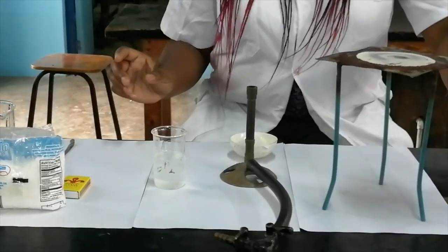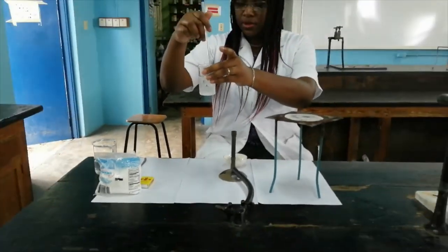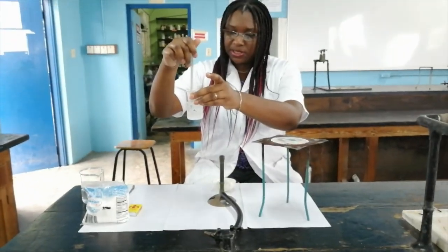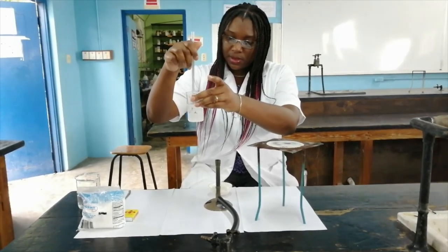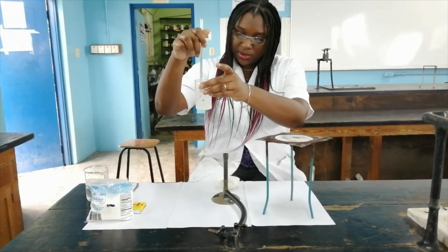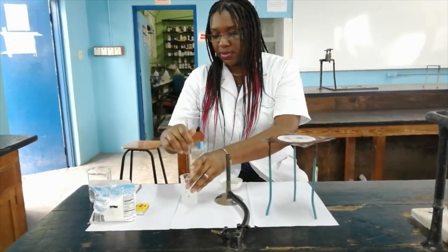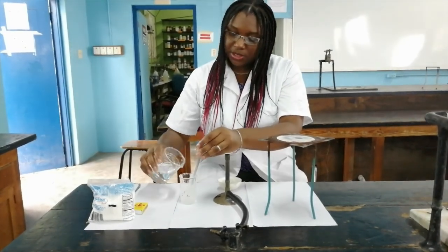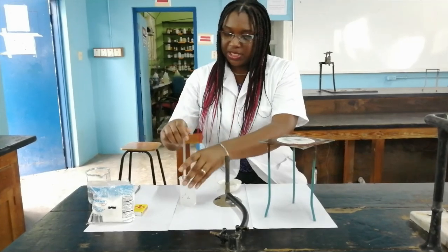To ensure that my solution is properly mixed I'm going to use a glass rod to dissolve the table salt. I did pour out a lot of table salt in a small beaker so it's taking a while to dissolve, so we'll add some more water to dissolve the table salt.